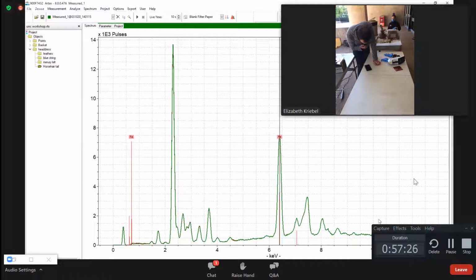How do you recommend cleaning the powderized arsenic? So these windows are removable. They're just stickers. So I would peel it off and put on a new one. I would not even try to clean up the arsenic in that case. If the arsenic is inside the instrument, if you look here, the little window is sealed by plastic. This should protect the detector and everything else that is in there.